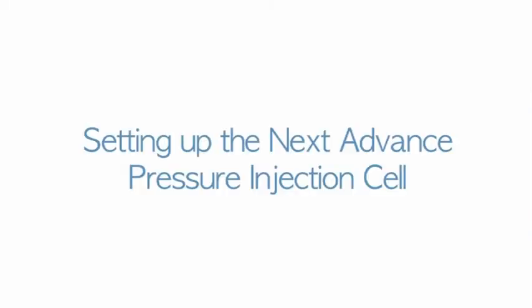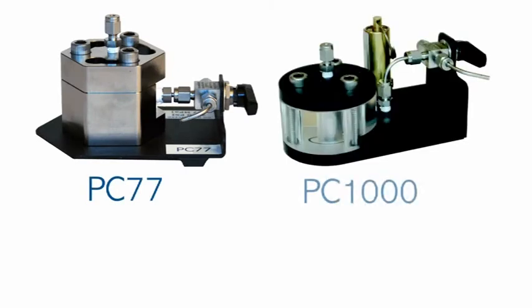Before using the Next Advance pressure injection cell, it's important to go through the proper steps to set up the instrument for safe and effective operation. Pressure equipment is dangerous and should only be serviced by trained personnel.